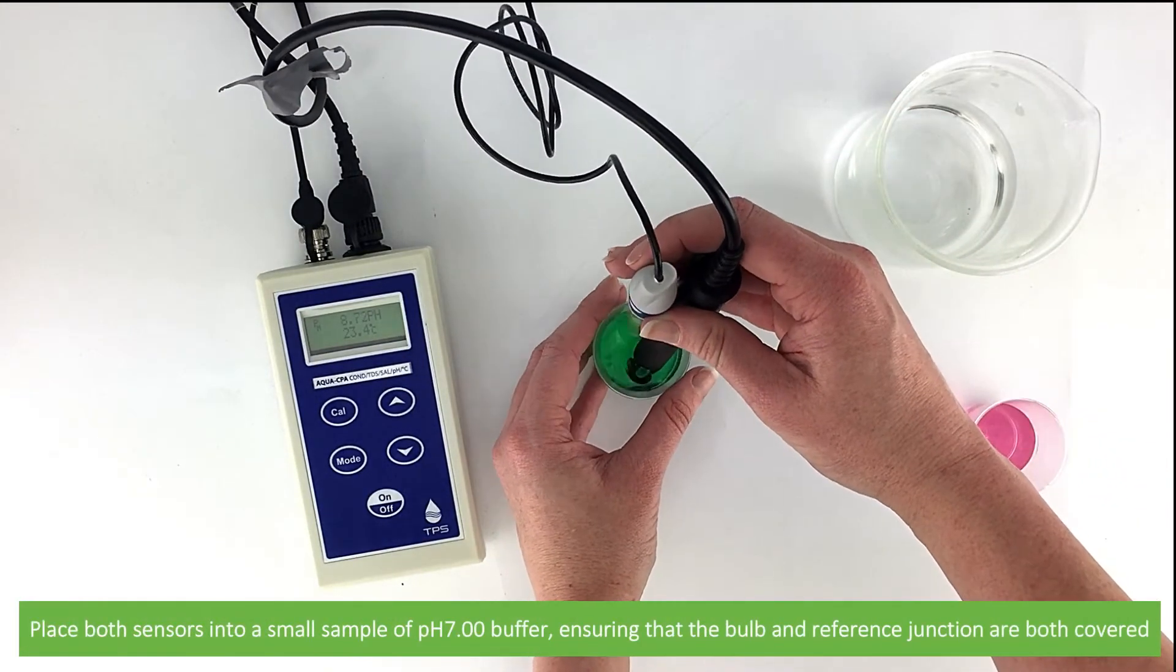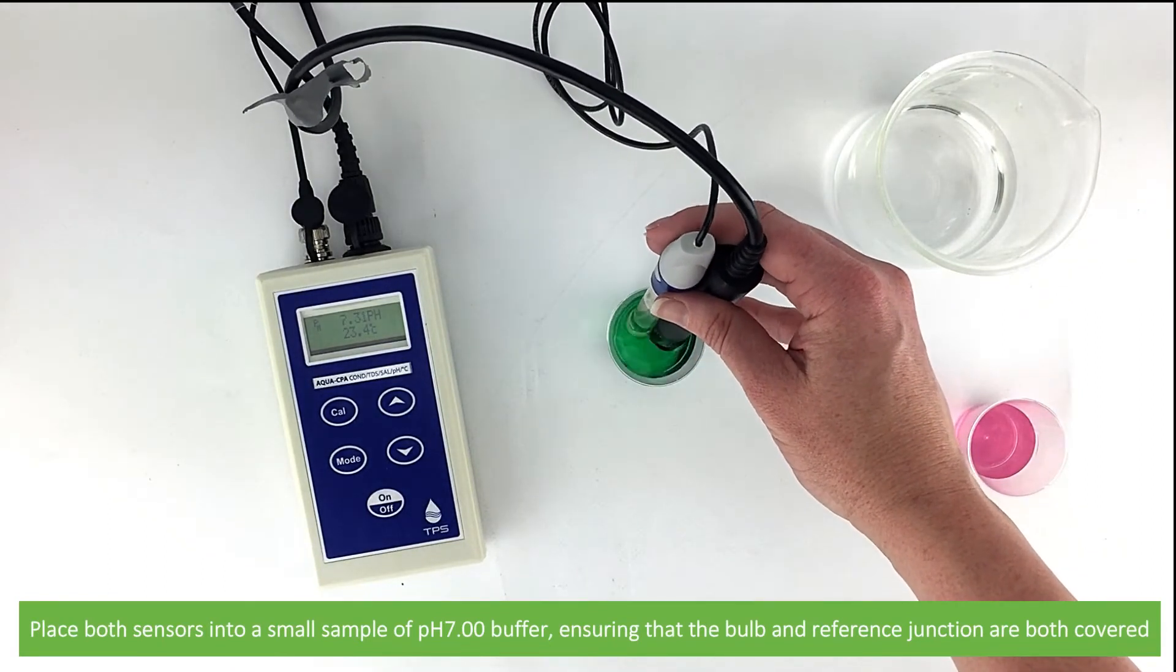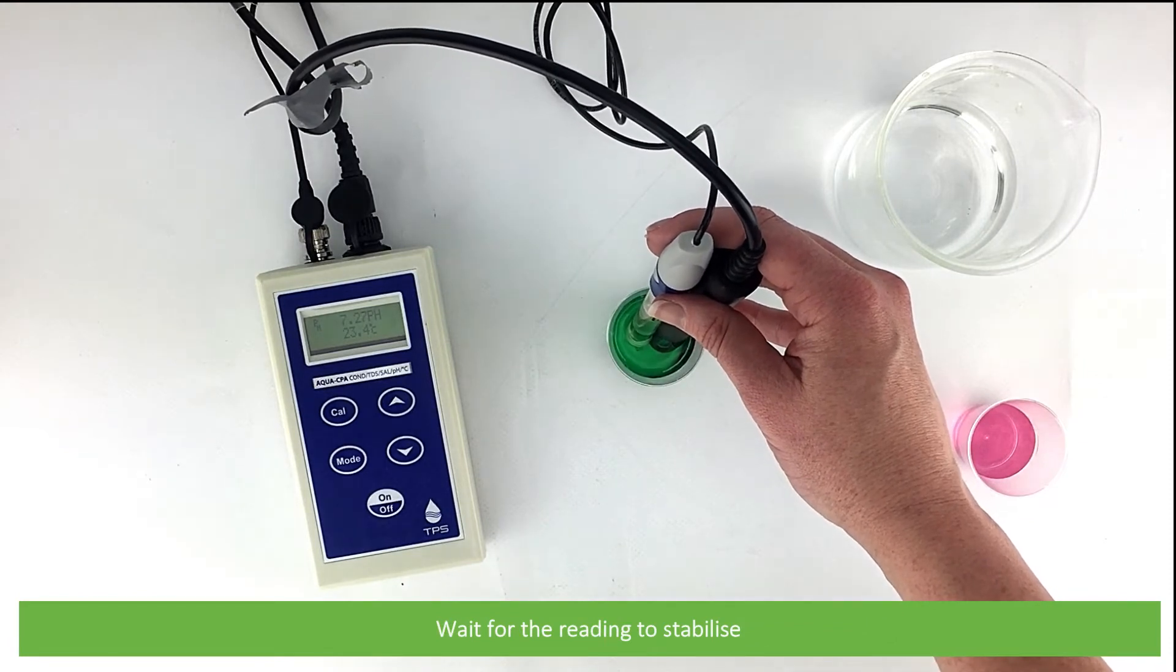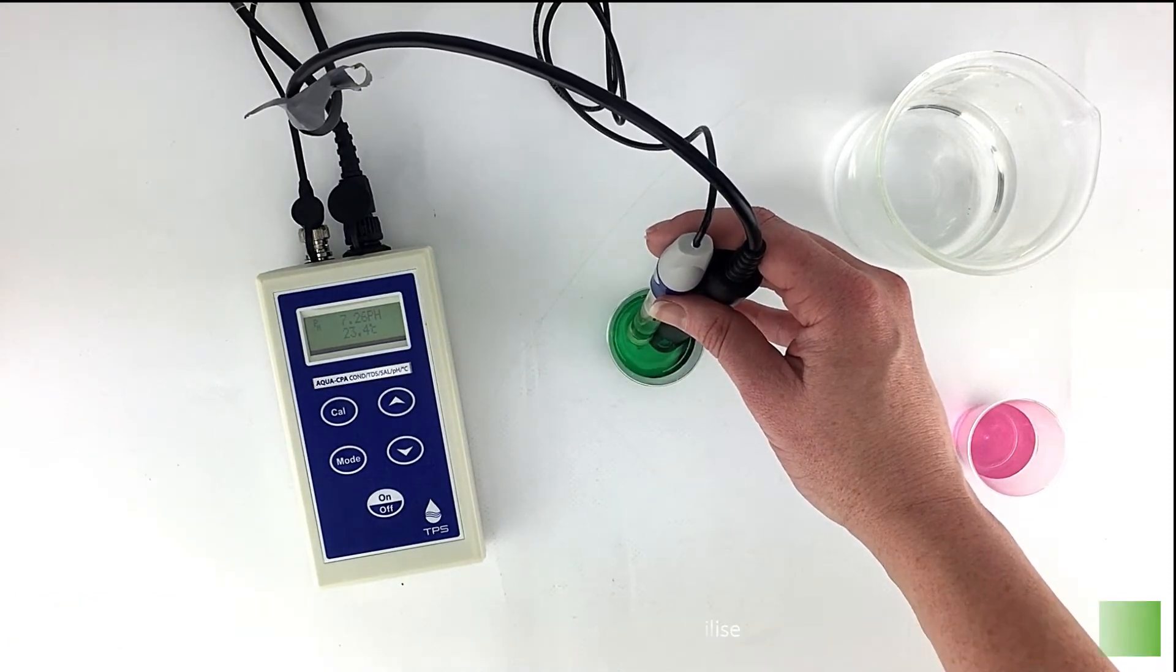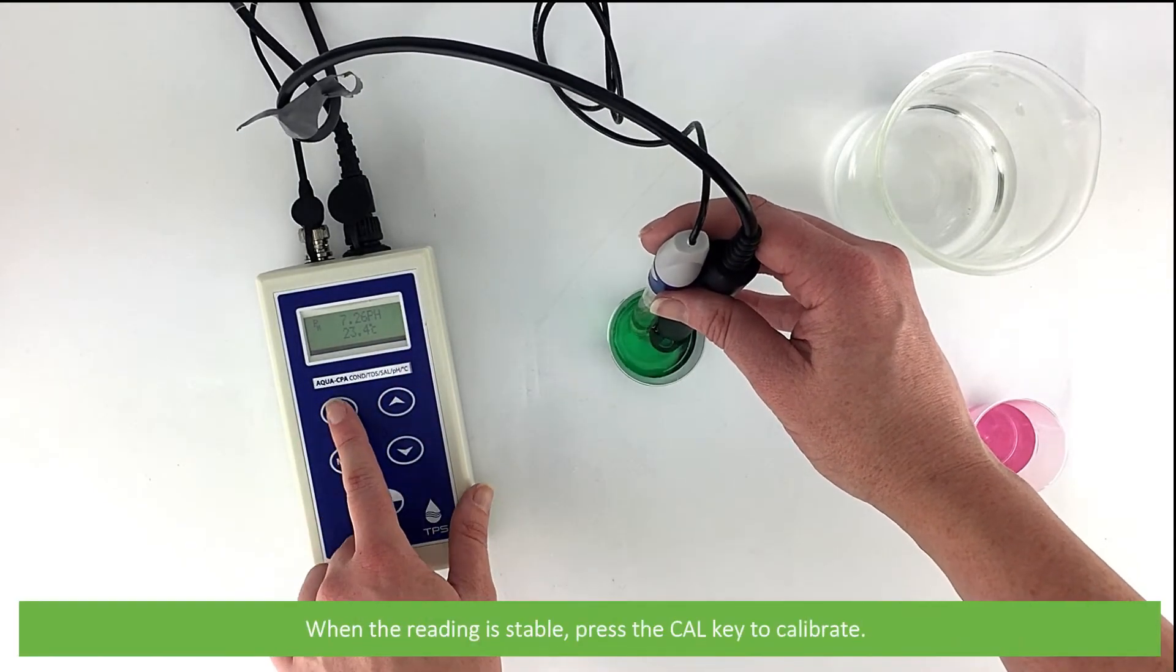Then place both the sensors into a small sample of pH 7 buffer, ensuring that the bulb and reference junction are both covered. Wait for the reading to stabilize. When the reading is stable, press the CAL key to calibrate.